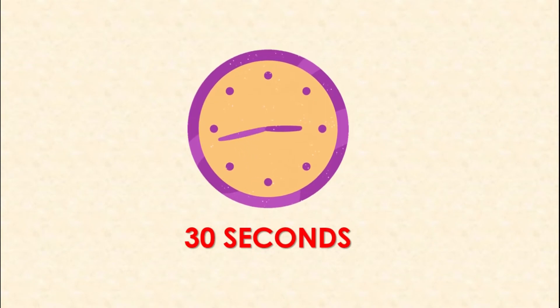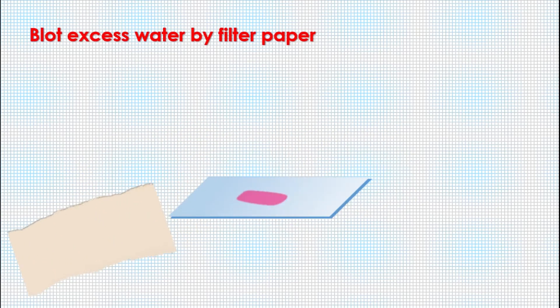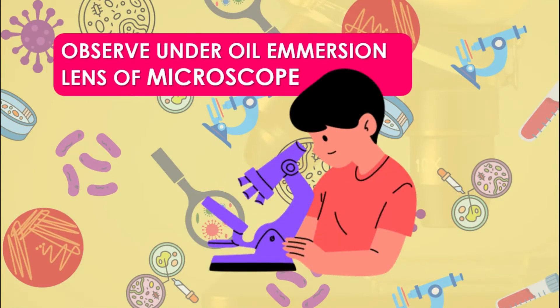Generally 30 seconds is used; maximum you can use one minute. The next step is to wash the smear again with tap water and allow to dry in air, or alternatively you can blot dry with filter paper. Your smear is then ready to observe under the oil immersion lens of the compound microscope.